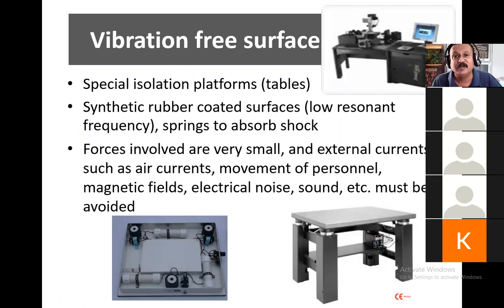And therefore the problem is, if I just blow air this way, what will happen? The probe is going to drift in air, drift in space. Can you understand what I'm saying? Yes, sir. The probe is so fine that if you just blow air on it, it is going to move.